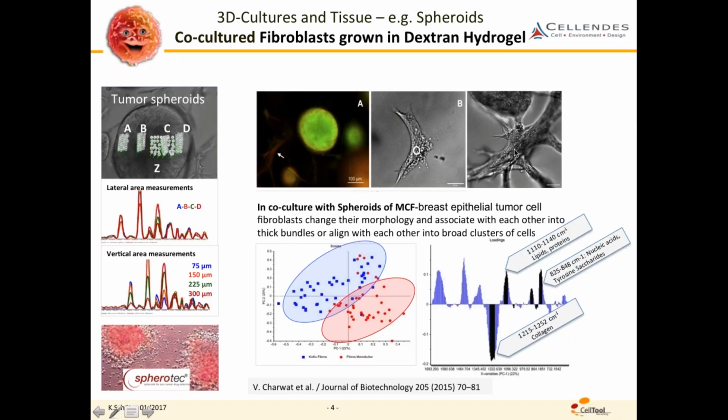And if you have a careful look into the microscope, we can also get the idea that the co-cultured fibroblasts seem to be much denser, meaning they have obviously built up a higher collagen network. So this was very nice to see, and especially here we can use the hydrogel and penetrate it with drugs to follow how those cells react, because this is a very flexible gel, and this is very good to be used in combination with Raman spectroscopy.